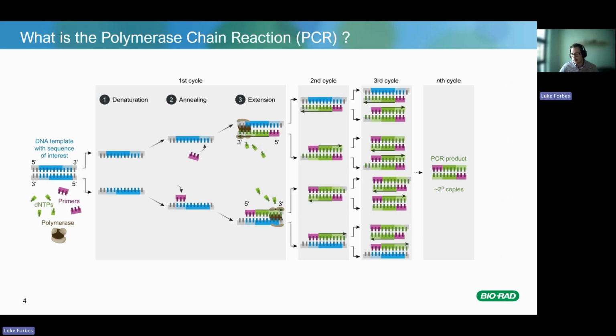So just as a recap, I'm sure that almost all of you in attendance know what PCR is, but it's a good base to build off of, because digital PCR or droplet digital PCR is a type of PCR just like conventional or real-time PCR. They all use the same technique where you amplify a specific sequence, and that allows people to produce millions of copies of a particular segment of that initial amplicon or a small sample.